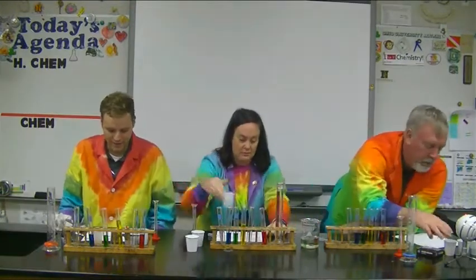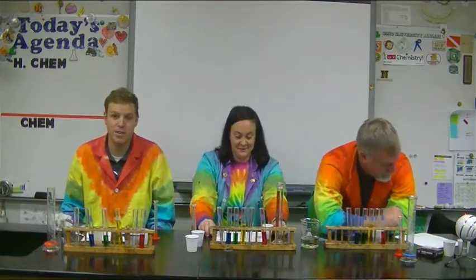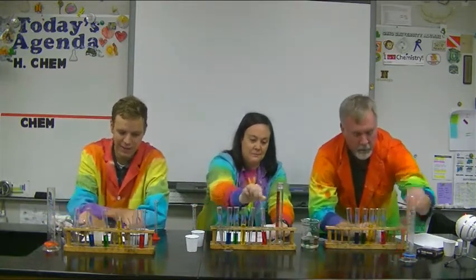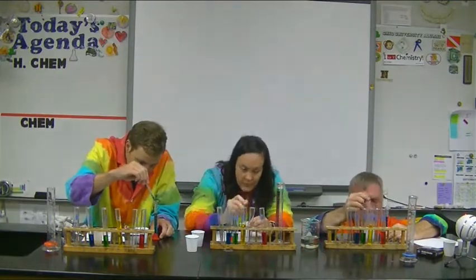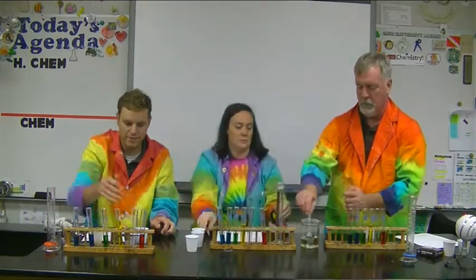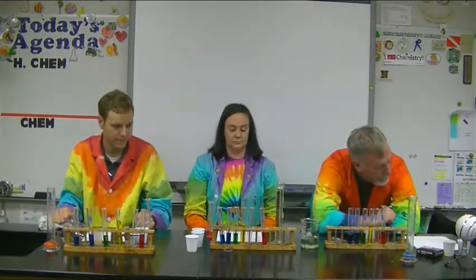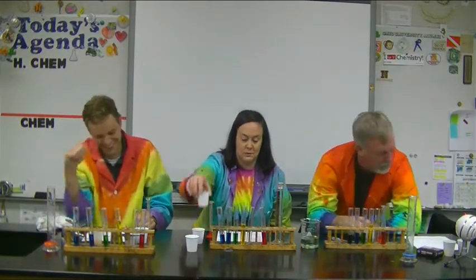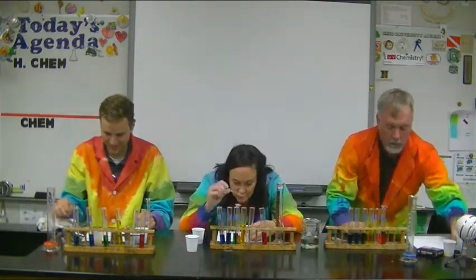What's next, Mr. Pilcher? Step 9, transfer 9 milliliters of the solution in cup 2 to test tube F. 9 milliliters. All right. Next, step number 10. Transfer 2 mils of the solution in cup 1 to test tube F and mix. 2 mils of 1.